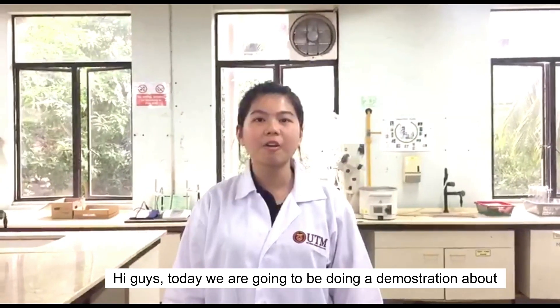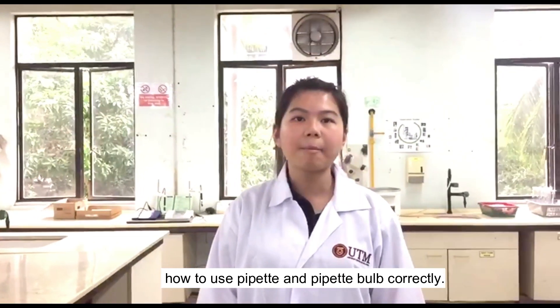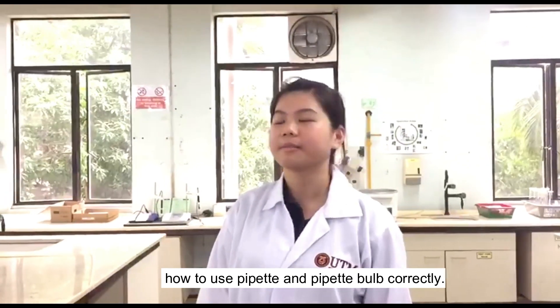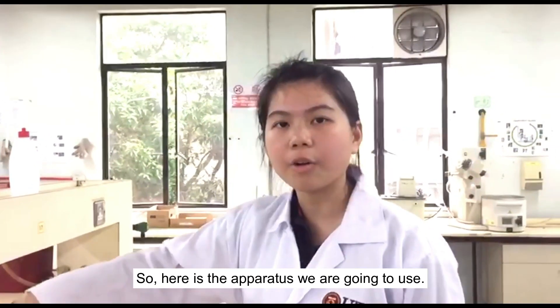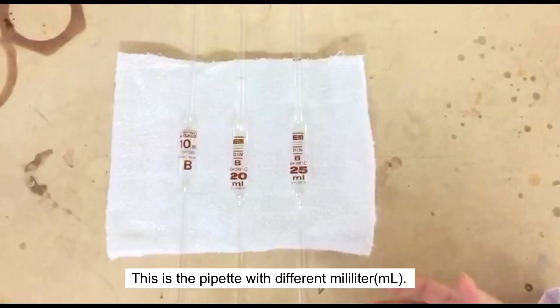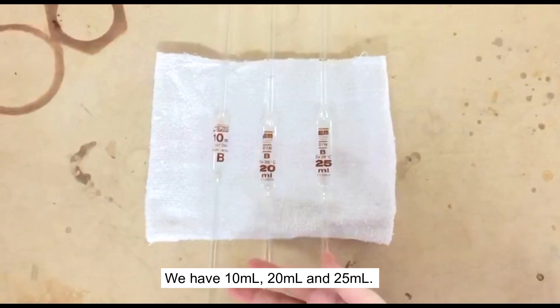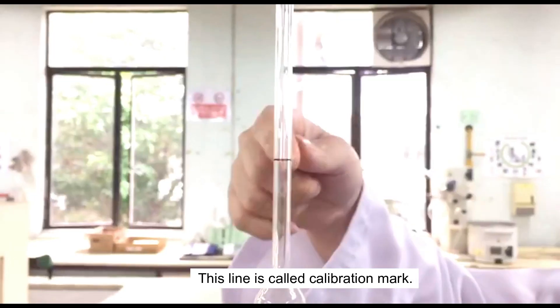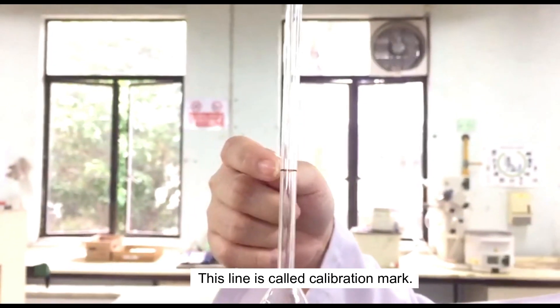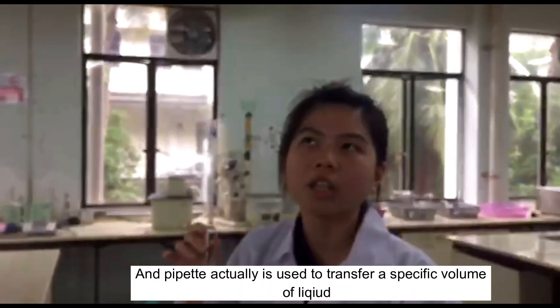Hi guys, today we are going to be doing a demonstration about how to use a pipette and pipette bulb. Here is the apparatus we are going to use. This is the pipette with different sizes — we have 10 mL, 20 mL, and 25 mL. This line is called the calibration mark.